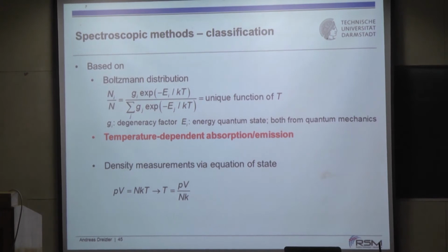Okay. Any questions? Yes, please. That's correct. Yeah. How important are those things? Can you compromise on the resolution? Yeah, well, you can compromise, of course, but then you compromise typically as well on your precision. Yeah, so there's no free lunch.